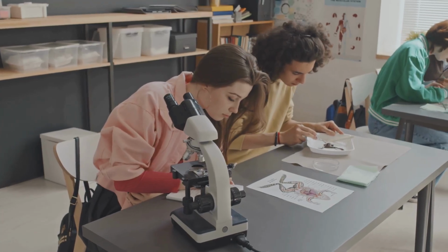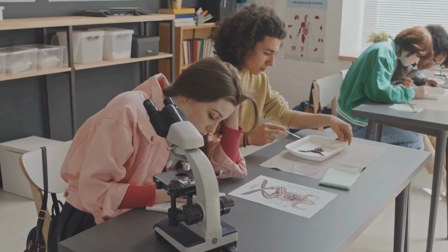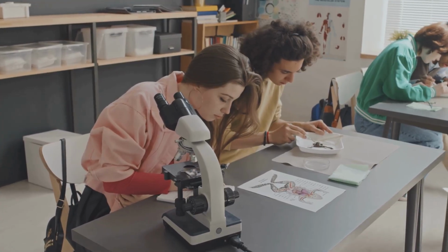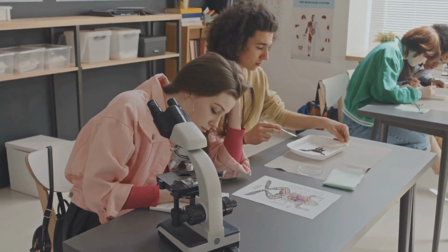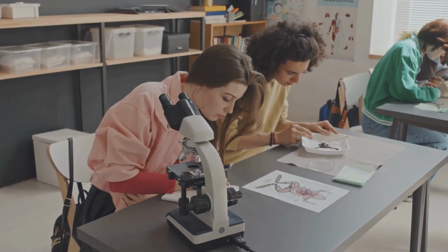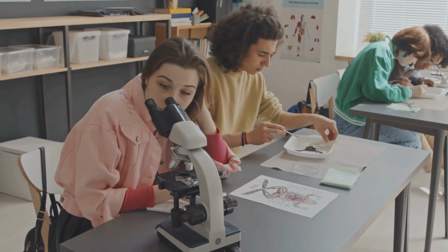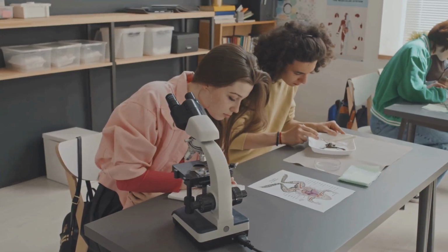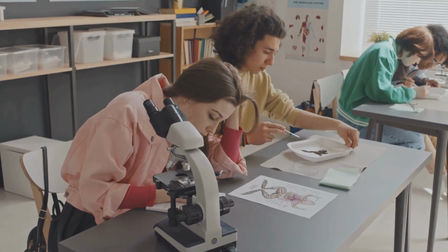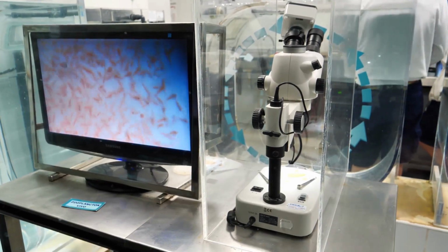To summarize, choose a light microscope when your priority is looking at living cells and processes. If you want to watch a cell divide, see bacteria swim, or observe how a tissue responds to a drug in real time, the light microscope is your only choice. It's also the right tool for routine tasks that require speed and simplicity, like checking a blood sample in a hospital or teaching students about cell structure in a biology class. They are relatively inexpensive and easy to use. Sample preparation is quick and straightforward. Their limitation is resolution. They can't show the finest details.